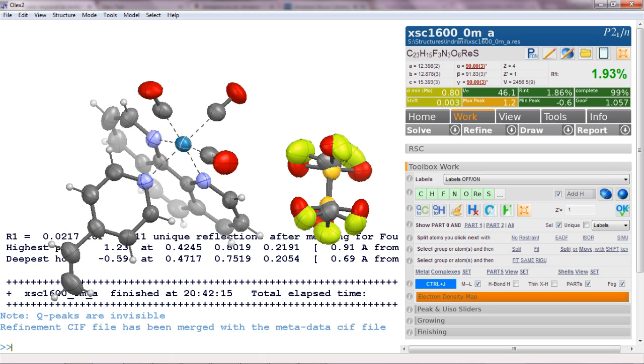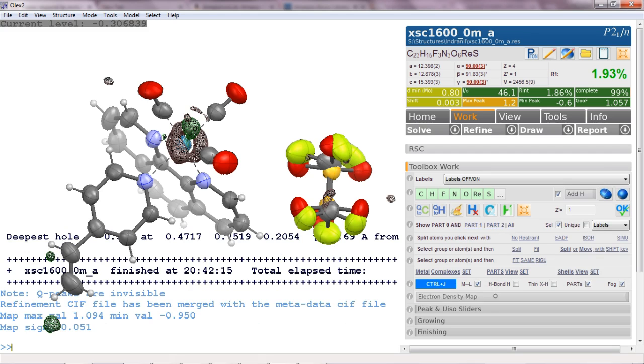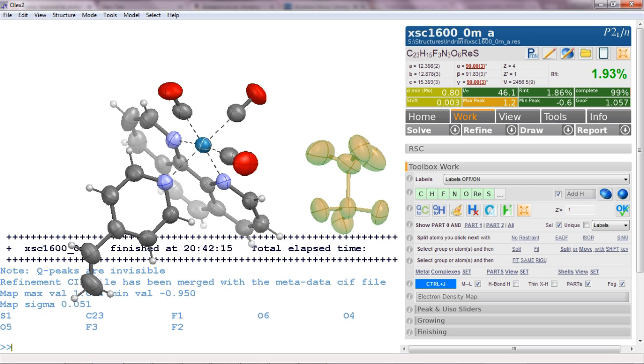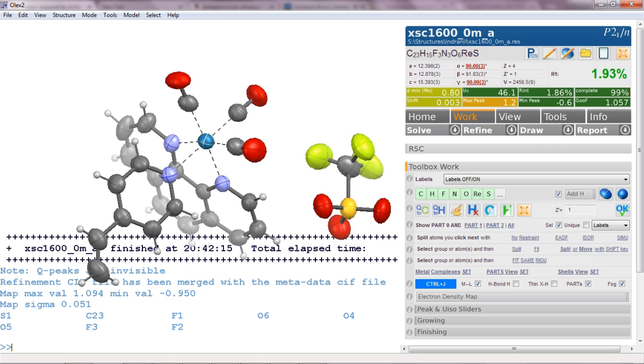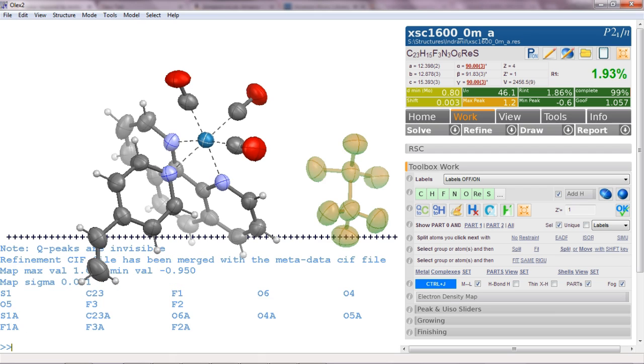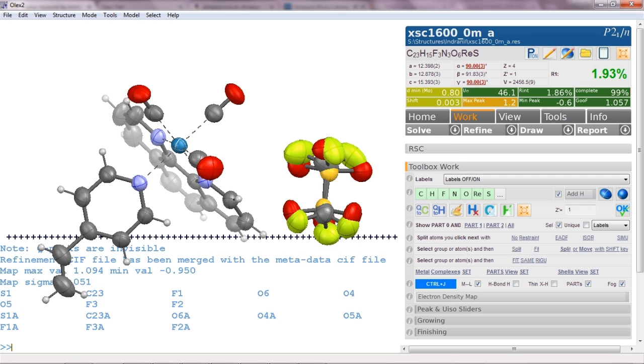So first of all, again, the density, and that looks very, very good. Let's look at part zero and part one. So this one looks like a very healthy triflate. Carbon's a little bit bigger, but that's kind of expected if it's moving about. And the same over here. So that looks very nice. Occupancies if you hover the mouse, so it's 34% in part two, and obviously the rest in part one. So we can look at both of them.